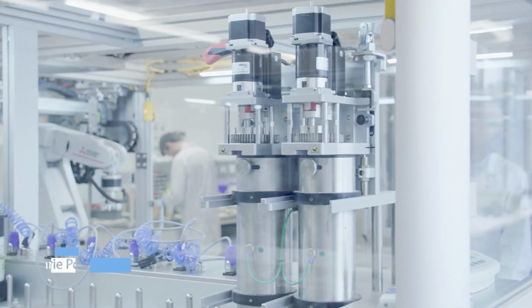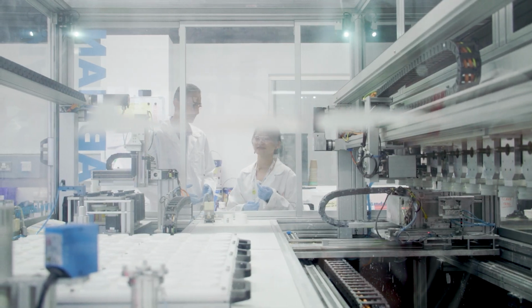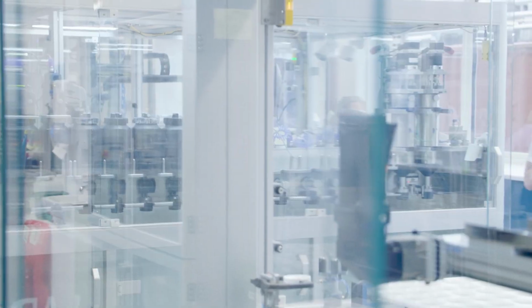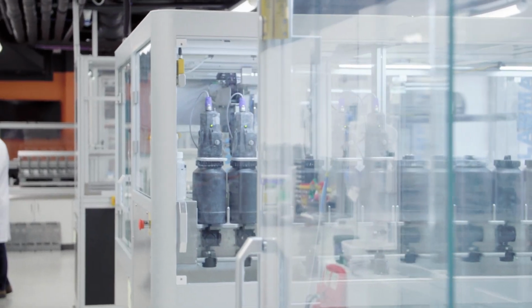My name is Marie. I am an R&D and DKM data analyst. I work with the robots by putting data in and then analysing the data that comes out. The robots are great for us because they allow us to scale up our production more time efficiently, and also standardise the tests a little bit better.